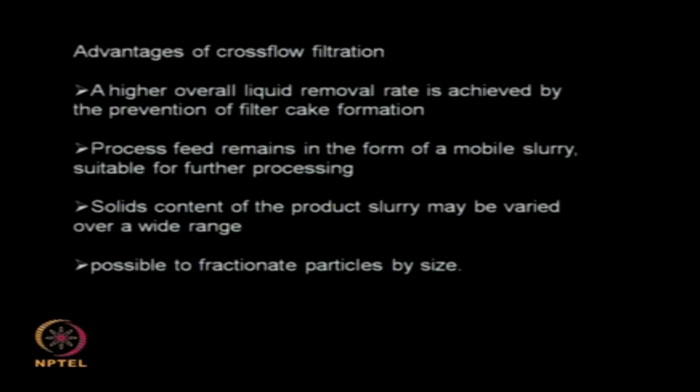So advantages, as I said, removal rate is very good and it prevents the cake formation, and the feed remains as a mobile slurry, unlike a normal filtration where you have the solids and the slurry sitting on the solids. We can look at different percentages of solid present in the slurry, and it can also do fractionation of the particles by size. That means I can get solids of different sizes separated using this type of approach.